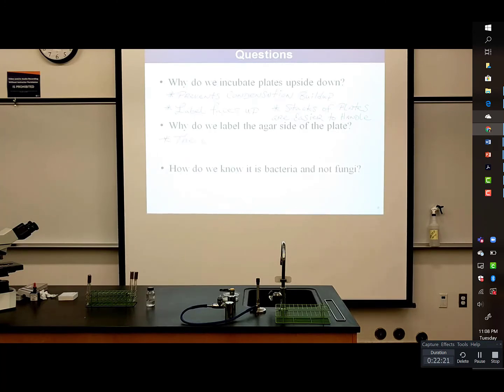The label is present on the part of the plate where growth is present.